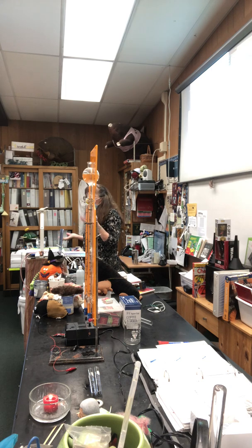It looks like aluminum foil, but it's platinum. It's very non-reactive. In the tubes is a solution, and it's not pure water. Hopefully you know enough not to take electrical devices into the bathtub, so you don't get electrocuted. But it actually takes a bit of time.